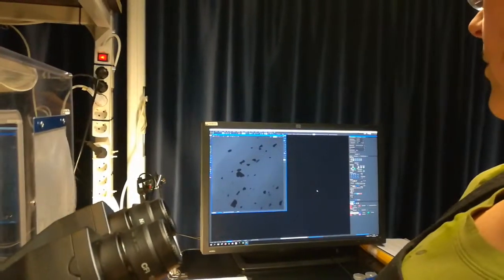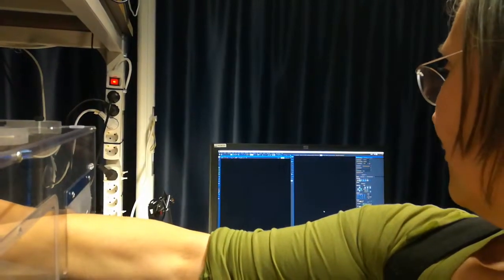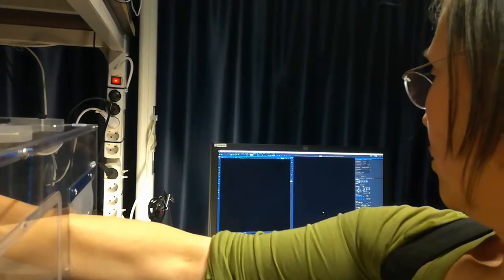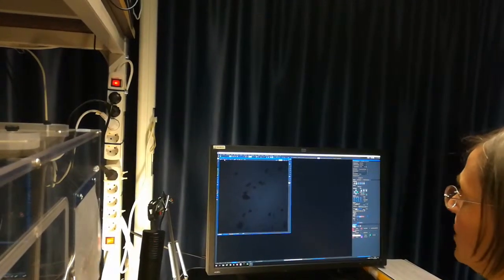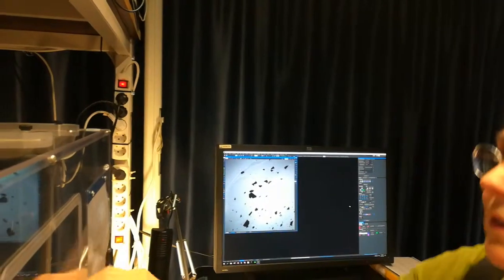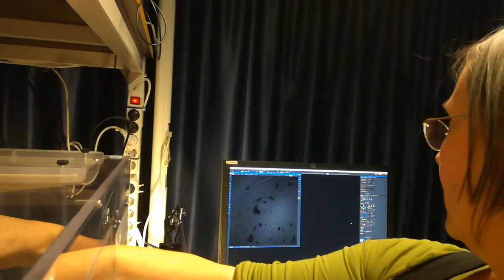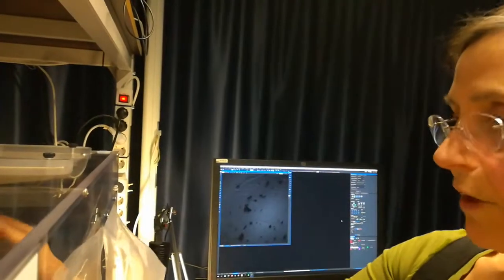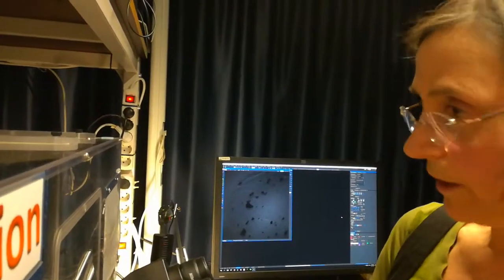We have an aperture far away called the field stop, and it's a little bit far away from the condenser. We're closing that. And if you look at the screen, you can see that when I close this field stop, what happens is that first the image becomes darker. If I close completely, my image may be completely black. I can push the display — basically push the brightness and contrast — as you know, it only changes what we see on the screen; it doesn't change what the image actually is. I close that and it goes very, very dim. I cannot see the shadow of the field stop right now, which is the aim — when everything is in focus I will see the shadow of the field stop.